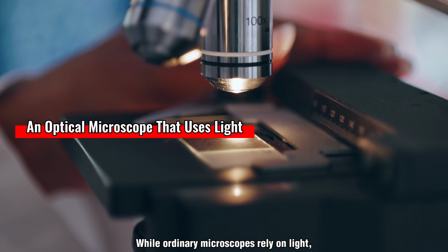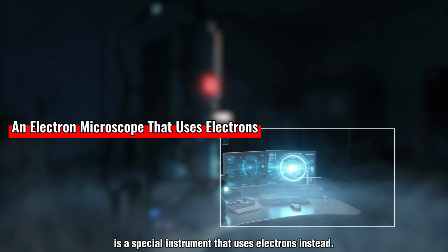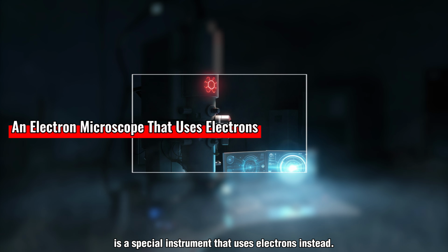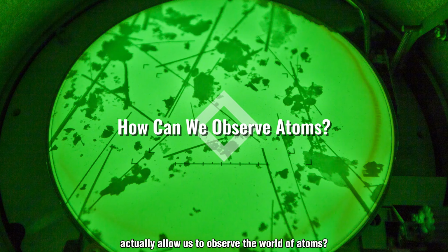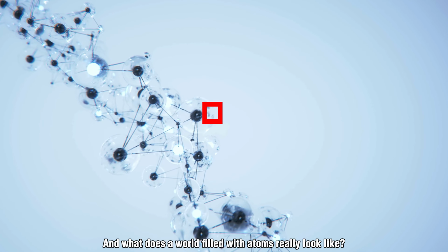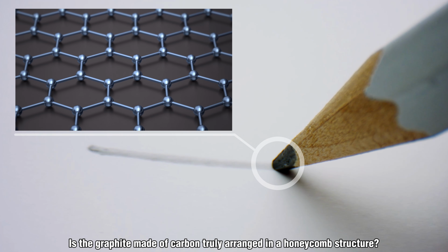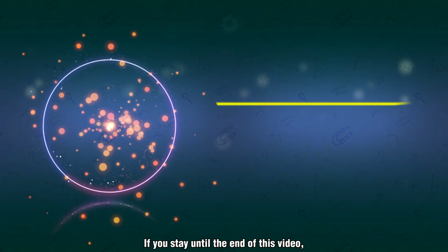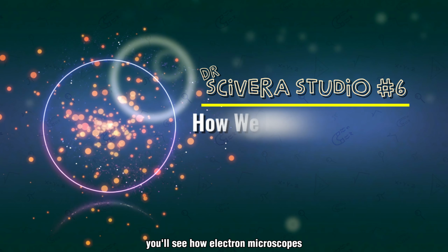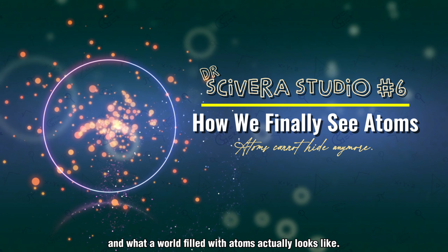While ordinary microscopes rely on light, the microscope that reveals the world of atoms is a special instrument that uses electrons instead. So how does this microscope actually allow us to observe the world of atoms? And what does a world filled with atoms really look like? Is the graphite made of carbon truly arranged in a honeycomb structure? If you stay until the end of this video, you'll see how electron microscopes make it possible to observe atoms and what a world filled with atoms actually looks like.